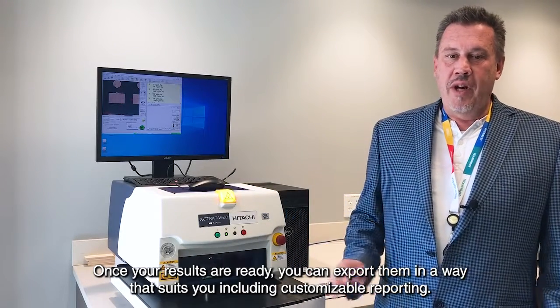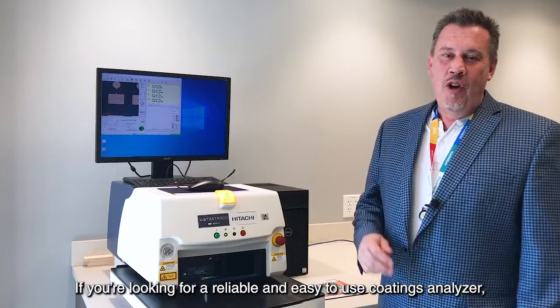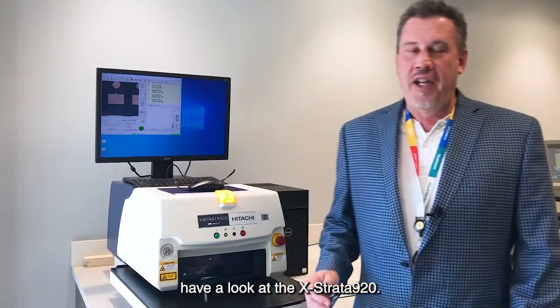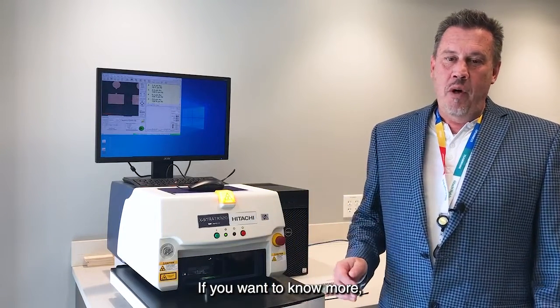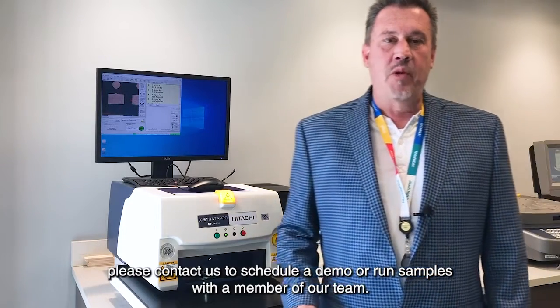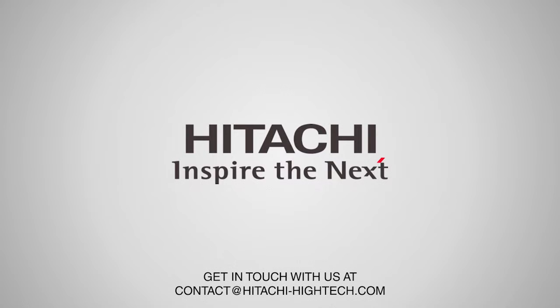Once your results are ready, you can export them in a way that suits you, including customizable reporting. If you're looking for a reliable and easy-to-use coatings analyzer, have a look at the Extrata 920. If you want to know more, please contact us to schedule a demo or run samples with a member of our team.